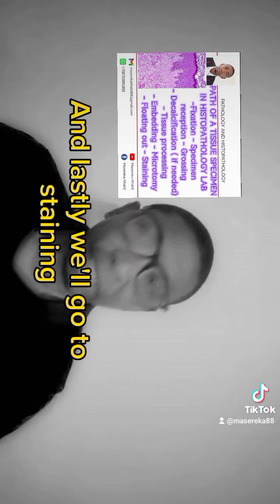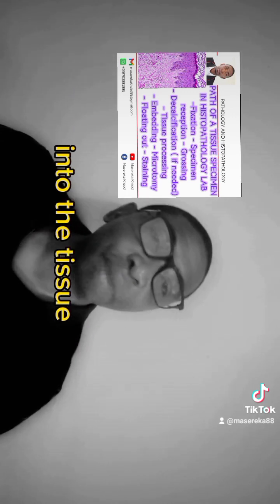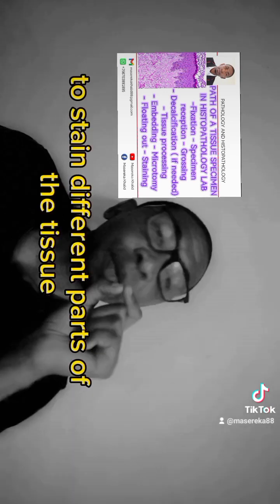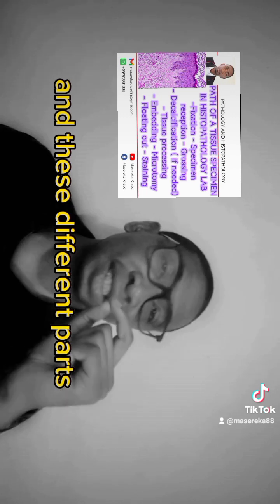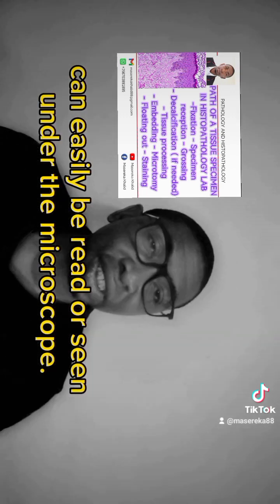And lastly, we go to staining. Staining is aimed at imparting color into the tissue or the section that was obtained during microtomy. And by imparting color, we are able to stain different parts of the tissue, and these different parts can easily be read or seen under the microscope.